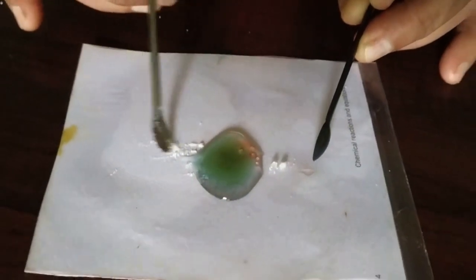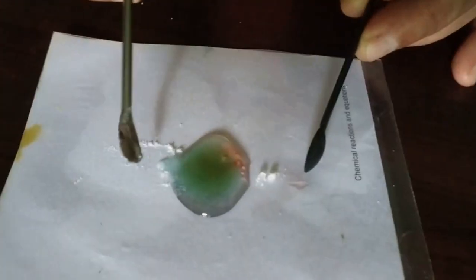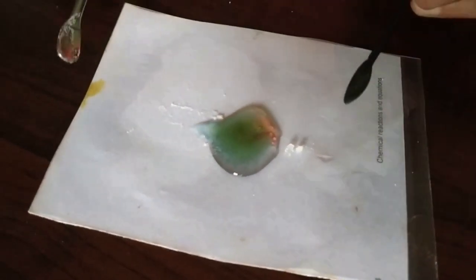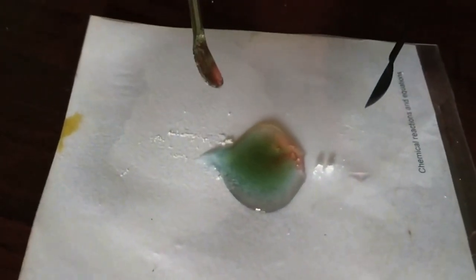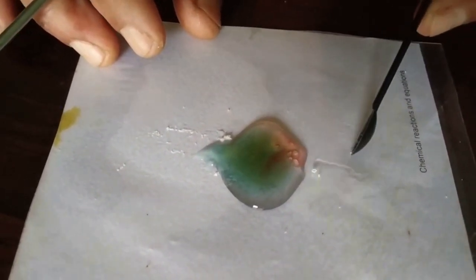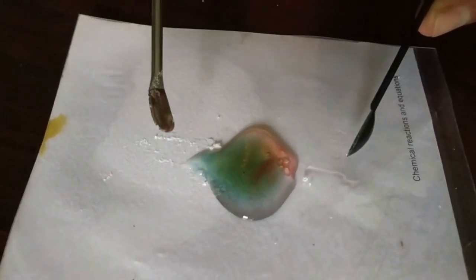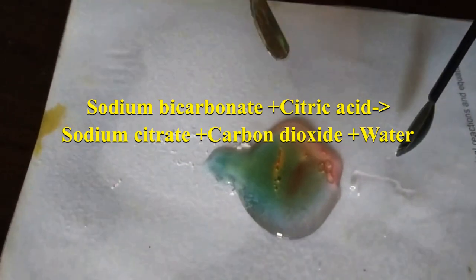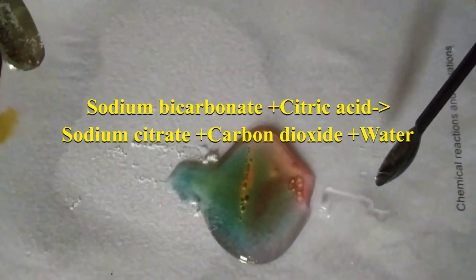Now you can see the color of indicator at citric acid is turning red, and indicator at sodium bicarbonate is slowly turning blue. At the center still it is green, the watercolor. Gradually when this red color and the blue color meet, that is the site of the reaction. Citric acid will react with sodium bicarbonate and you will get sodium citrate with the release of carbon dioxide. So you will be able to see the bubbles of carbon dioxide at the site. Now itself you can see at the center the bubbles are getting formed.